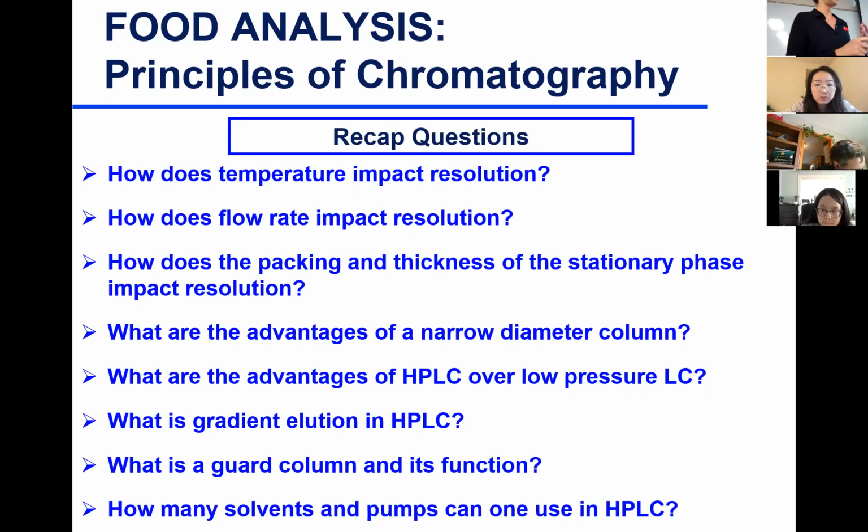Yeah, it is speed with high performance liquid chromatography. You have shorter analysis time. You have better resolution because your column is packed under pressure. You don't have very much void between the particles. So you have sharper peaks. You can collect the samples better.